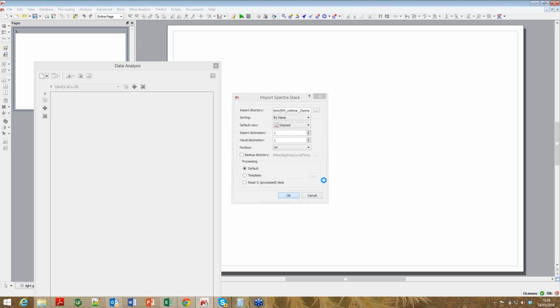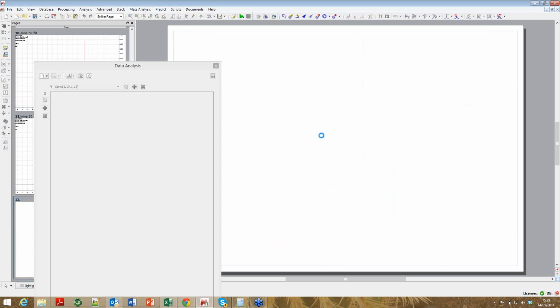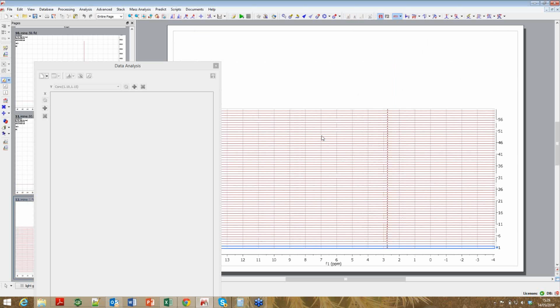I think it's going to be quite tricky in some cases. I'm sure in other cases it won't be that tricky, and I'm sure we'll do something along those lines as well. But I wanted to make the point that there will always be cases where a manual tool to do the alignment is important to have, and this is shown in this spectral data set.